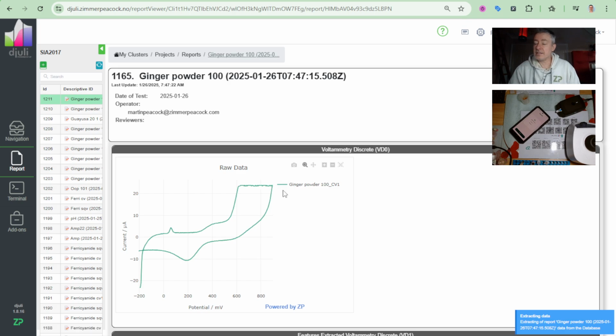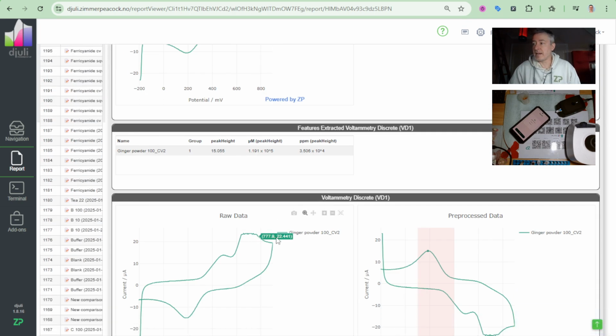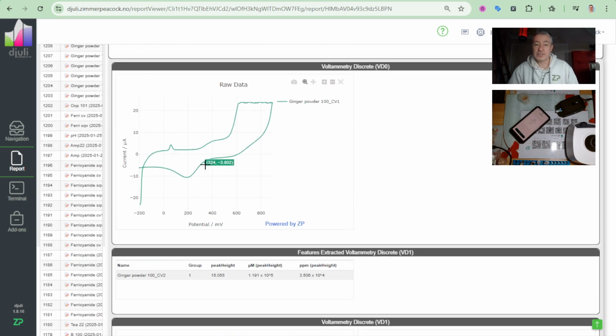See the way it's flatlined? It's flat. I mean, I get a better peak now, actually. I get a better peak. But look at the way that's flat. This is telling me, and we can make the app actually call this out. But what I'll describe now is what I did next.